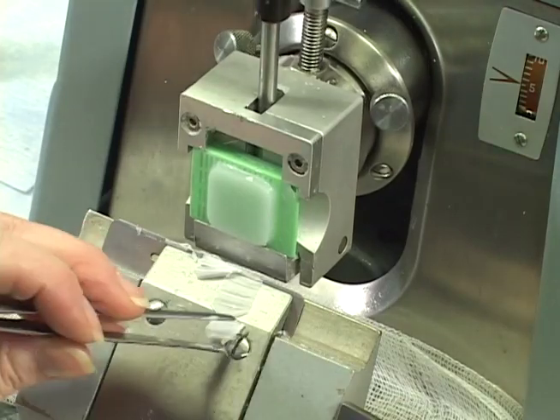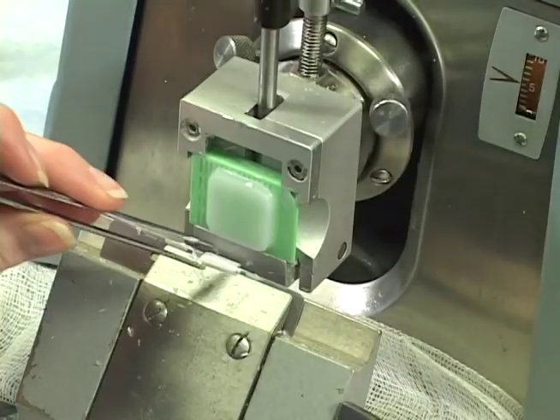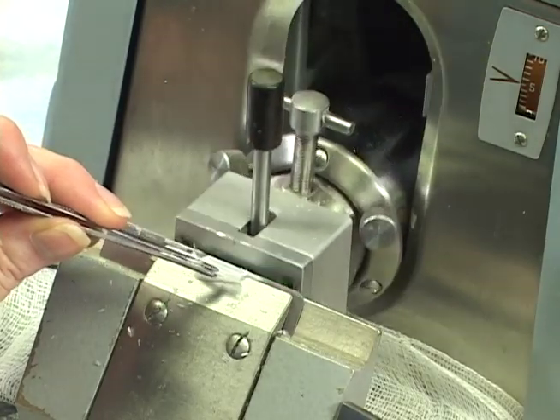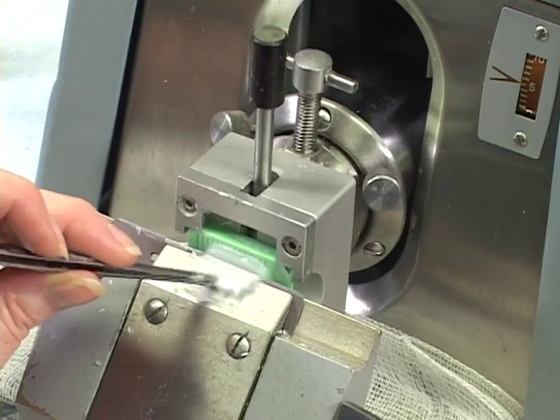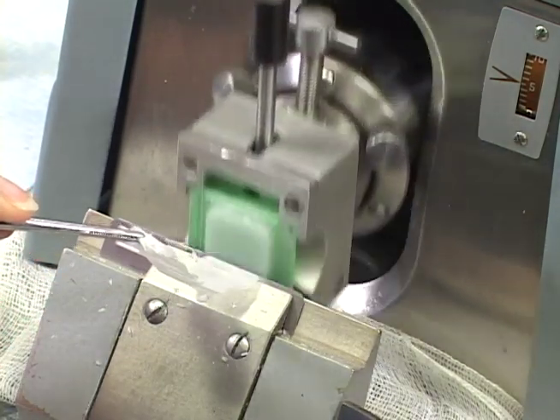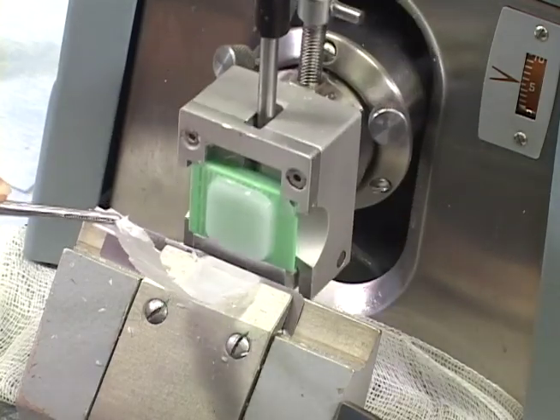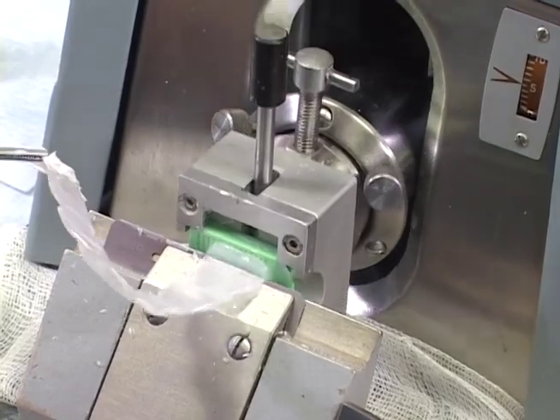Again, it's better to not use your fingers to pick up the ribbon. It's better to use a forceps. And you get your nice ribbon. And you can see this is a very nice microtome. It cuts a very nice ribbon.